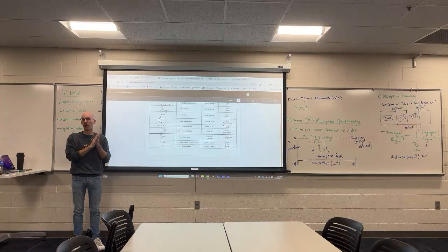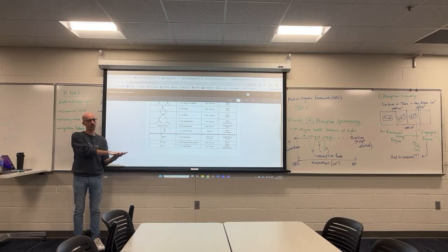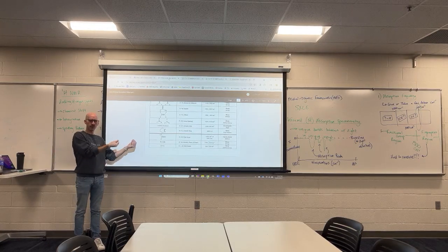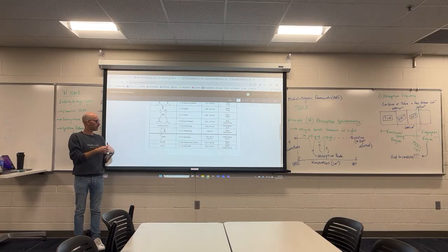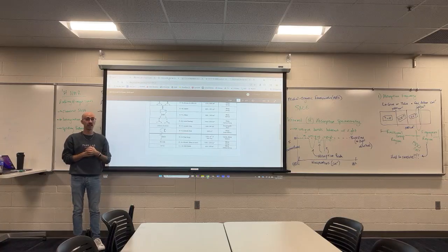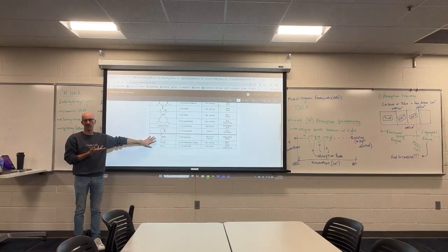So what I'm going to say to you guys is, we don't often analyze the fingerprint region. Not in my class. You're welcome to, with a grain of salt, right? If you know what is plausibly in your compound, then you can try to ascertain which of these peaks it might be. And if you know something can't plausibly be in your compound, don't try to correlate it to one of these bonds. Yeah?